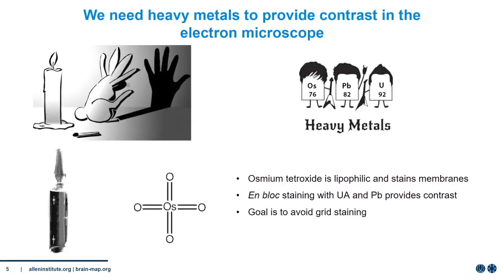So now the question is, how do we prepare our tissue for electron microscopy? As I mentioned, this is not a normal-sized EM sample, but rather a large, millimeter cube, which in our world is ginormous. So we need to stain an otherwise transparent tissue with heavy metals.